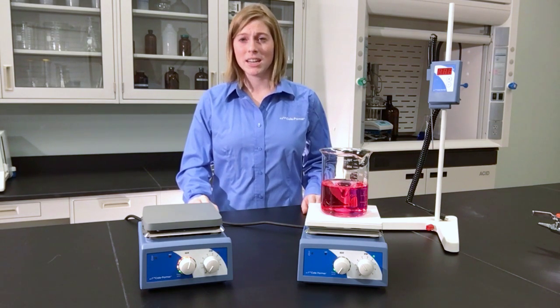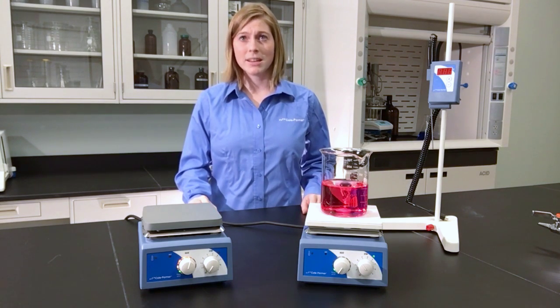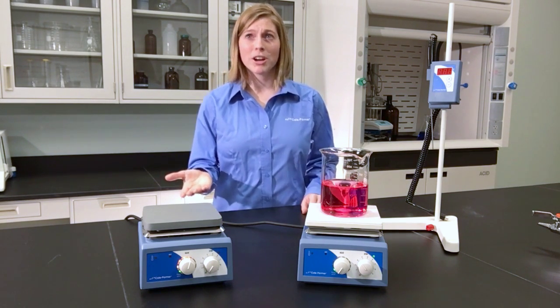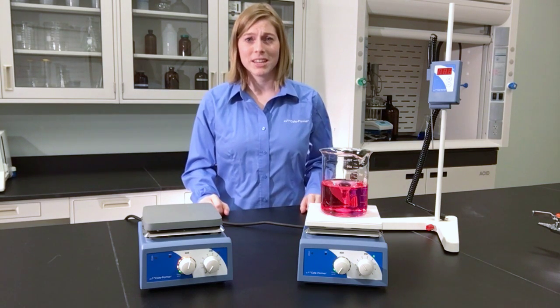The unique color-coded LED indicator shows the current temperature status, so you always know when the unit is at temperature. Choose from coated aluminum models for quicker heat-up times or glass ceramic tops, which are excellent for chemical resistance and easy cleanup.